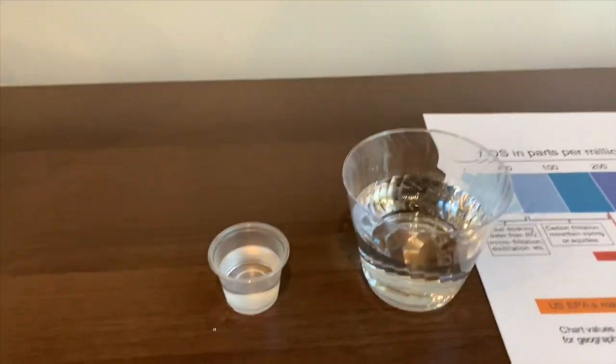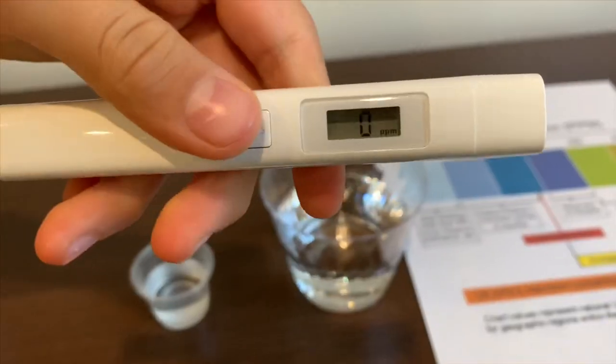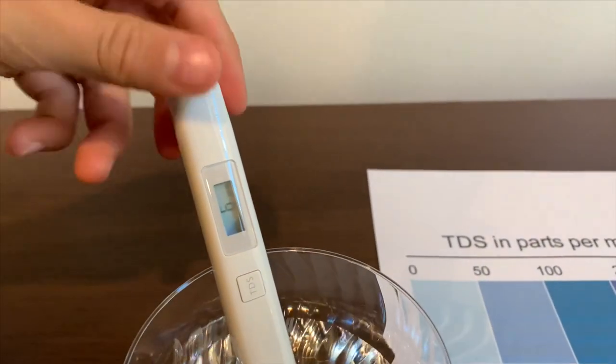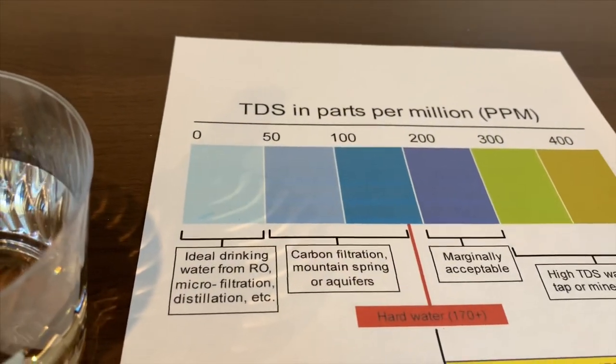Let's test the TDS level first. Turn on the TDS tester and make sure it says near. Let's put it in and wait. It's 6 — that is ideal drinking water.